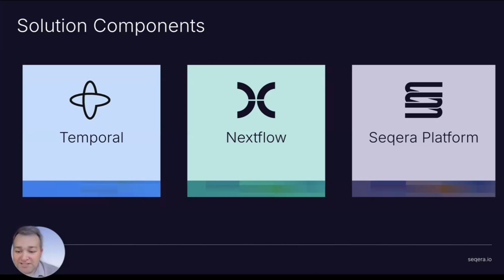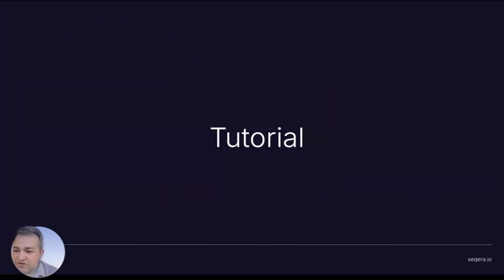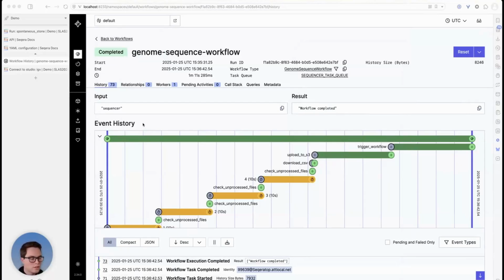And so we're going to be using Temporal for the first few pieces of our workflow, where we're uploading the raw data to S3, where we're fetching the metadata, and then triggering the workflow within Seqera Platform. And after that, Seqera Platform will handle all of the rest. So I'm now going to hand things over to my colleague, Edmund, who will give the demo of our tutorial, and will also provide, before going into the solution itself, a little bit of a demo of Seqera Platform and what it offers. Okay, thanks, Ken.